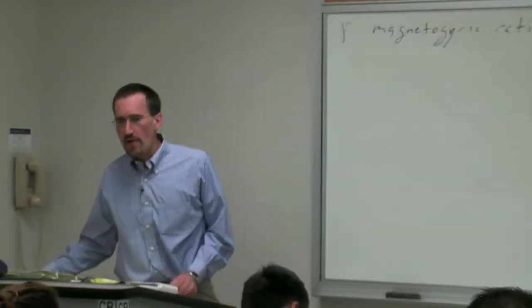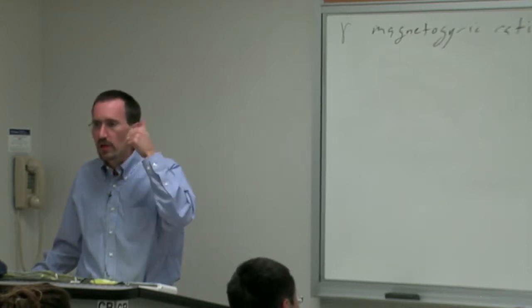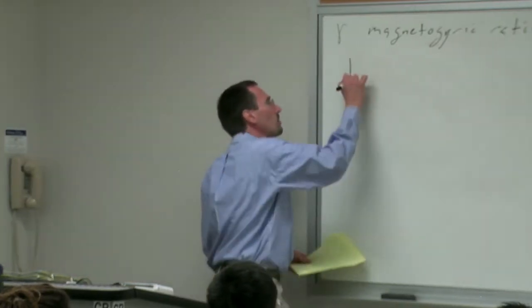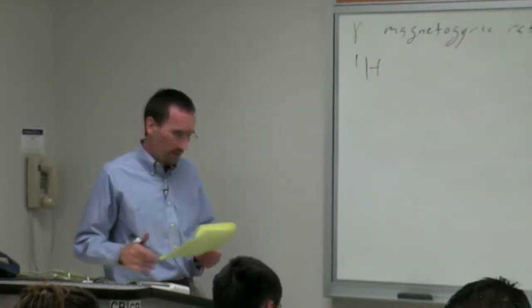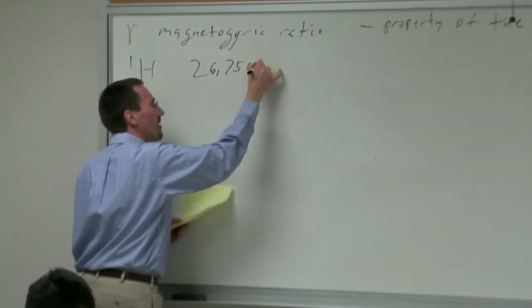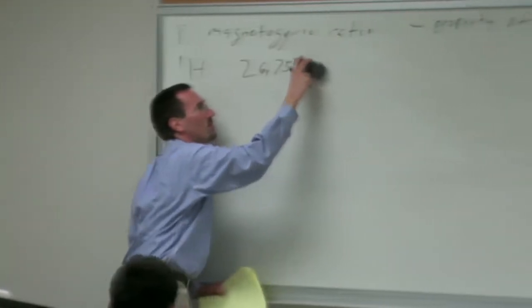The bigger the gyromagnetic ratio, or magnetogyric ratio, effectively the bigger the nuclear spin, the bigger the magnet that the nucleus is. Protons actually are good. They have one of the biggest magnetogyric ratios of any nuclei studied, 26,750. Oops. And it's 53, what am I thinking here?